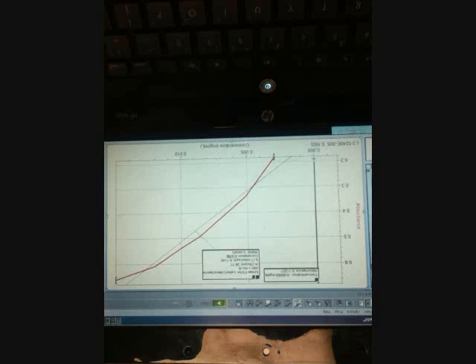A systematic error we encountered was that our colorimeter was not as good as we needed it to be to get the proper results, and that's why our percent error was so high. A random error is that we could have pressed the keep button on the computer before the colorimeter was done reading the cuvette that we put in.